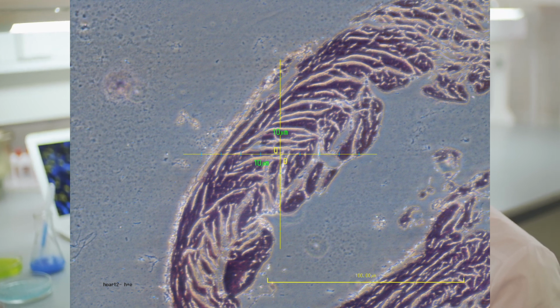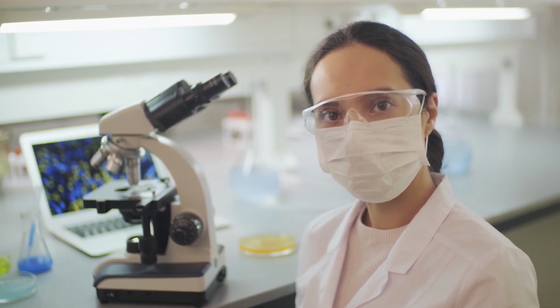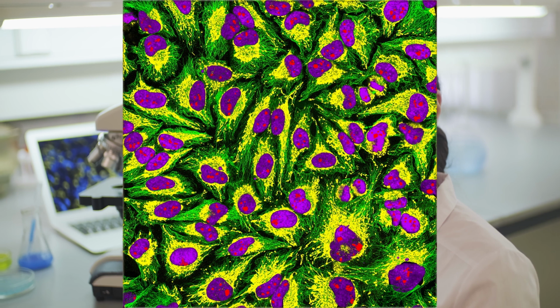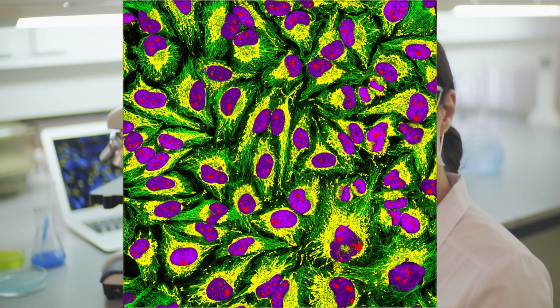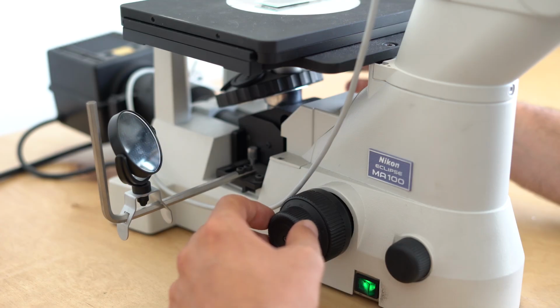For example, a fairly common example is DAPI. DAPI allows it to enter the nucleus, and therefore the stain is really only present in the nucleic acid area of the cell. That means you really only see where the DNA is, and to a certain extent RNA as well. This can be very useful if you're trying to trace something from, say, the nucleus to the RNA and see where the RNA is building up, if you're looking at, say, messenger RNA, for instance.